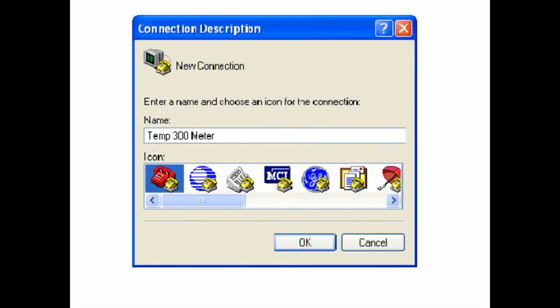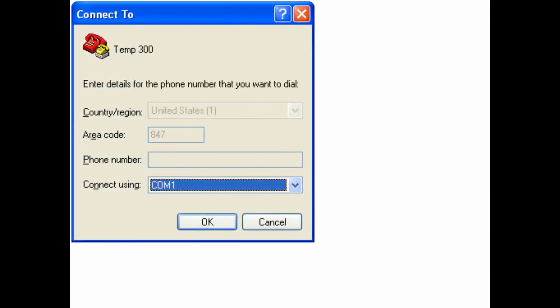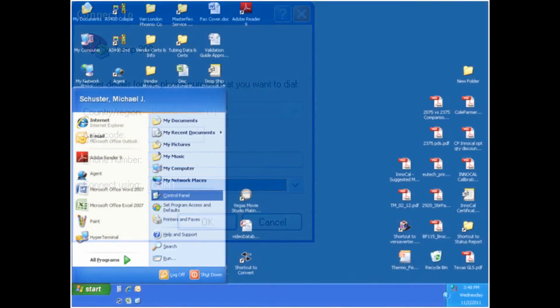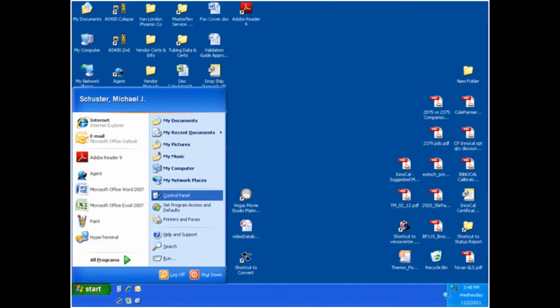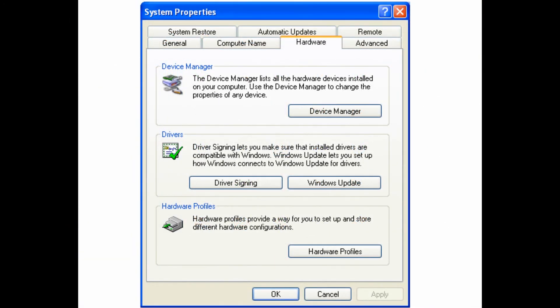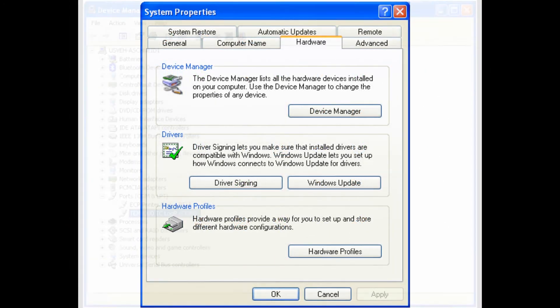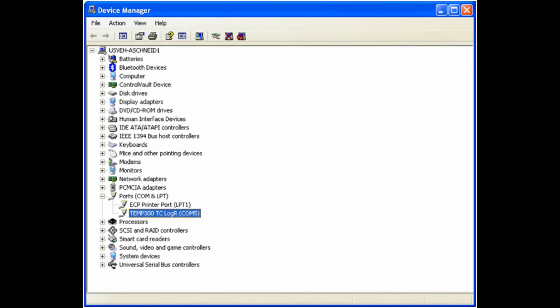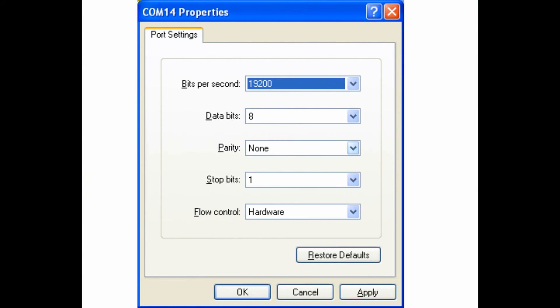You will then be prompted to provide any name of your choosing for the download. Once this is done, click OK. You will then need to select the COM port that the meter is using — it is usually COM 6 or higher. To find out the exact COM port, go to Start, Control Panel, System, Hardware, Device Manager, and Ports. Expand the ports to see the details and unplug then plug in your thermometer to see which specific COM port it is using. Enter the COM port details, which are listed in the instruction manual for the driver and shown in the video, then click OK.